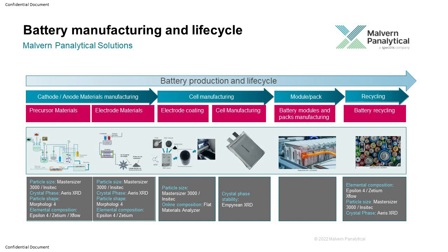Then you convert this, mix it with lithium, and make the final cathode material, which is lithium NMC oxide. So for this, we have a range of solutions because these are powder materials. So the particle size plays a role. Particle shape plays an important role. Crystal structure is very important, and the chemical composition, because if it is NMC 811, then you would like to have 80% nickel, 10% cobalt, and 10% manganese. So the chemistry becomes very important for these powder materials.